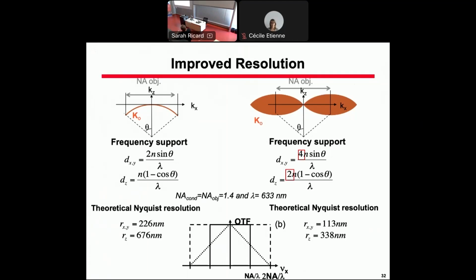While in synthetic aperture microscopy, holographic microscopy, we are able to keep this constant transmission. So the difference is not in the extension, the difference is in the transmission coefficient, which is higher than in the regular microscope. So this gives the so-called theoretical increased resolution.